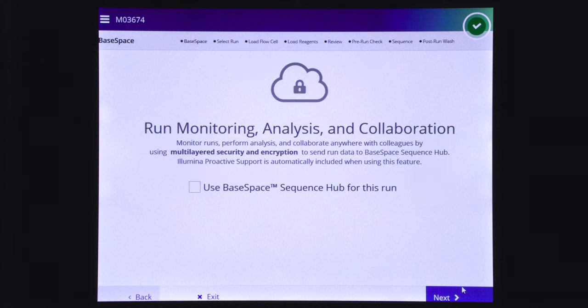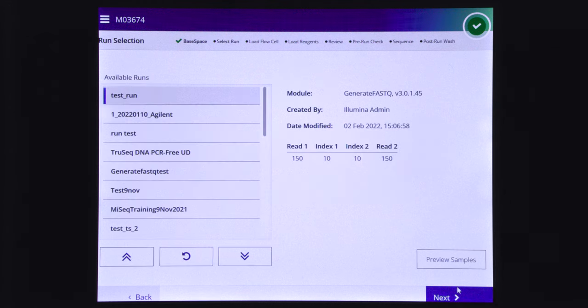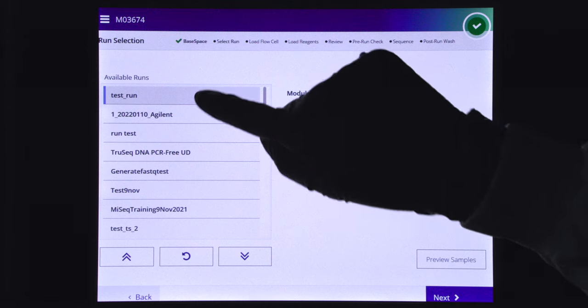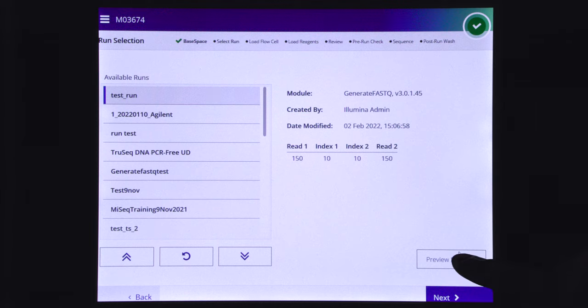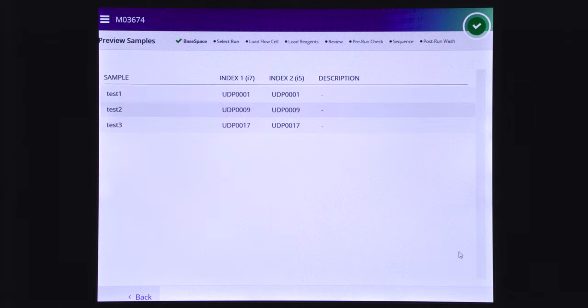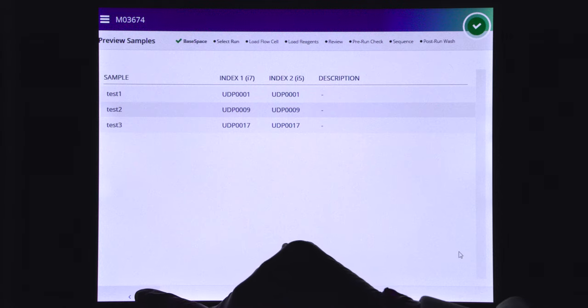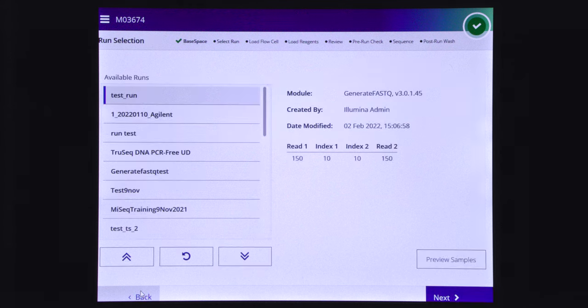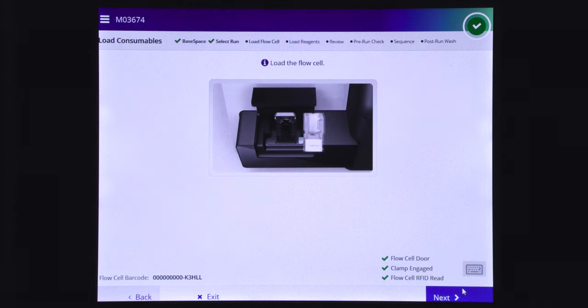In case you want to upload your run to the cloud, select use base space. Otherwise, select next. Select a run from the list of available runs on local run manager. Select preview samples to view samples that are associated with the analysis. Select next to proceed to load the flow cell.